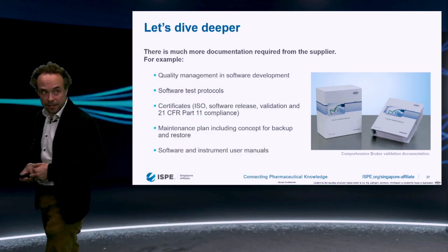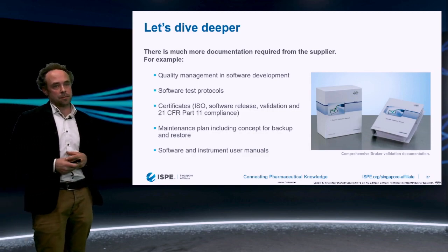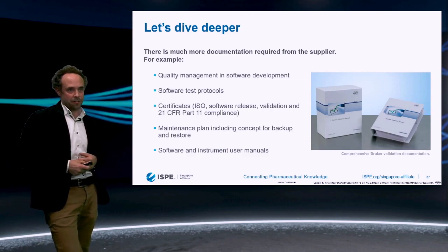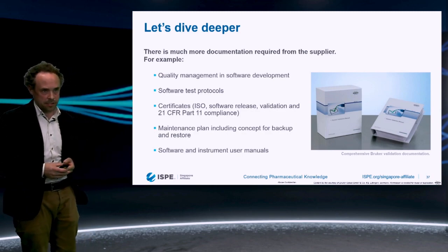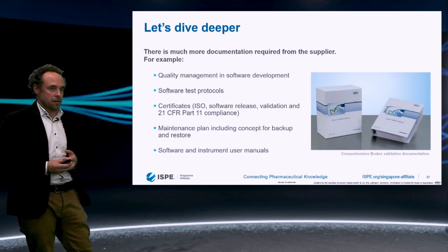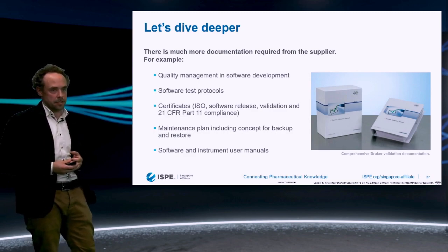It's a large topic, compliance topics. And so what about quality management in software development? Software is a very crucial part nowadays of an instrument delivery. Are there software test protocols existing, certificates, if it's ISO certificates, software release protocols, validation and 21 CFR Part 11 compliance statements?